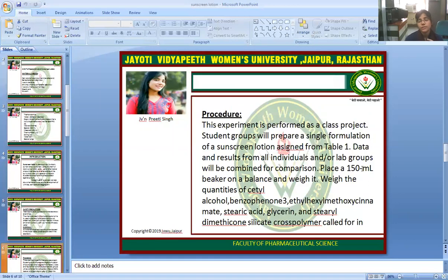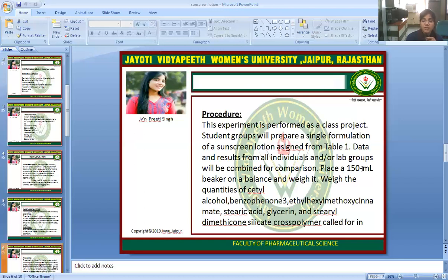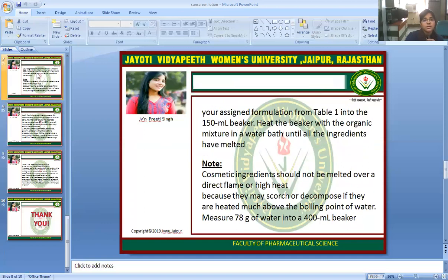This experiment is to be performed as a class project. Student groups will prepare a single formulation of sunscreen lotion assigned from the table of formulation data, and results from all individuals and lab groups will be combined for comparison. Place a 150 ml beaker on a balance and tare it. Weigh the quantities of cetyl alcohol, benzophenone-3, ethylhexyl methoxycinnamate, stearic acid, glycerin, and steryl dimethicone silicate cross-polymer as called for in your assigned formulation from Table 1 into the 150 ml beaker.